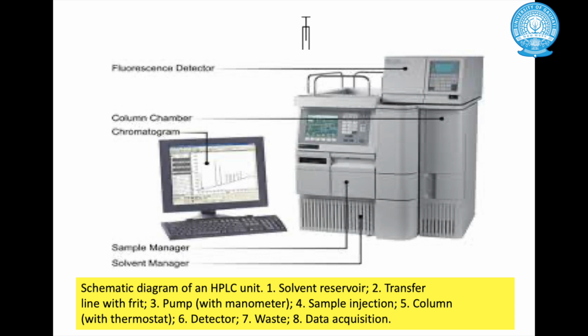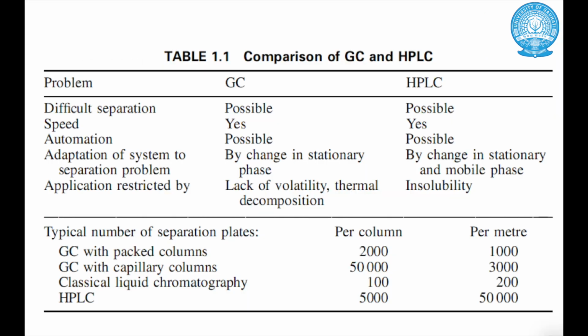So this time taken to elute from the column is called retention time.